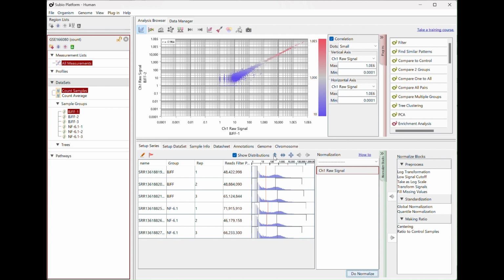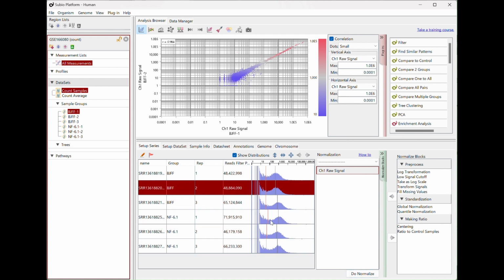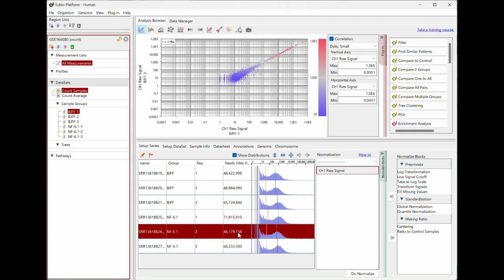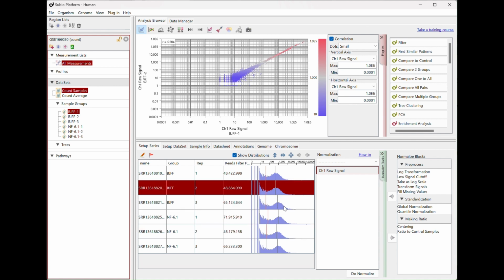The distributions of counts depend on the number of total mapped reads. More total reads shift the histogram rightward. RNA Seq datasets usually have variations in the number of total mapped reads by 2 times, sometimes more.